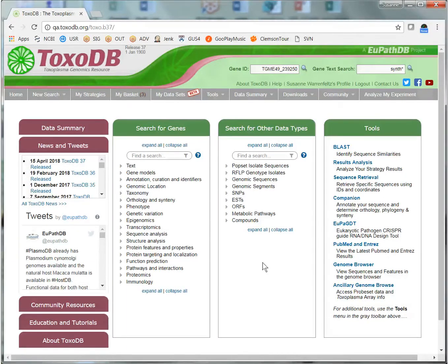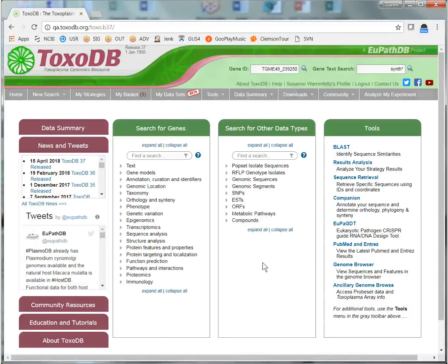The EuPathDB workspace is a private workspace for viewing and interrogating your own data against data that is already available in EuPathDB. This tutorial demonstrates the tool for exporting bigwig files from EuPathDB Galaxy to any EuPathDB site.